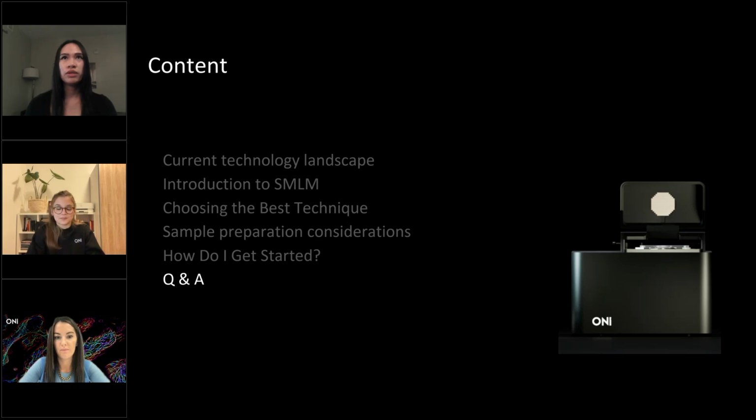So you can do single particle tracking 2 ways. You can do it in wide field. You can put your illumination mode into TIRF and track them on the surface, or you can do it in super resolution, which is PALM. You just have to adjust your sample preparations to include a PALM fluorophore. But for your virus that's at 25 nanometers, yes, you can do that.